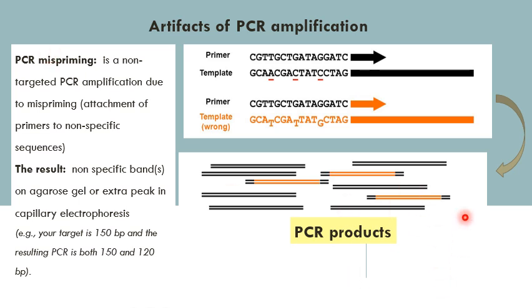And sometimes when you are doing capillary electrophoresis, instead of having just your expected peak, you might have some extra peaks because of the mispriming.